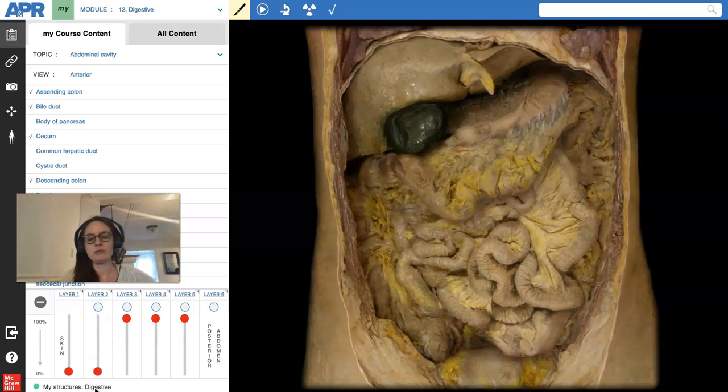And this is, we call it the abdominal cavity, but it's also the peritoneal cavity because the membrane lining it is the peritoneum. You do have the parietal peritoneum on the walls and the visceral peritoneum. And that visceral peritoneum is going to cover everything, including these mesenteries right here. So that's another thing that popular media gets wrong: your small intestine is suspended by these things called mesenteries. It's kind of like the sleeve right here.